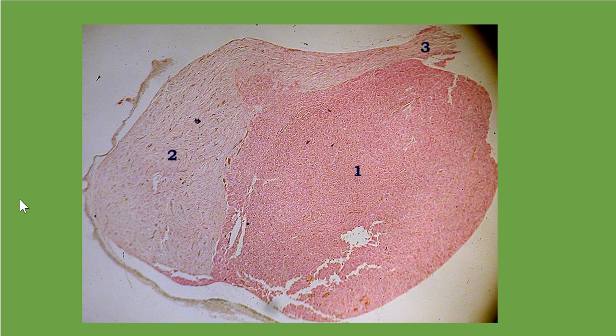One thing that is specific about this slide is you can see a clear division of the anterior to posterior, right? So that's one distinction that you can make when looking at the slide and trying to figure out what gland this is.